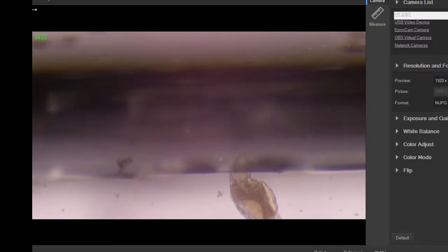Oh yes, there's a rotifer. Yay! Love rotifers. And something else too. Wow. That is a nice one too. Man, this slide is great. All right. Yeah, I put too much water on the slide, so you get in this zone where they kind of go in and out of focus a lot. I may have to wait for some of them to come out.